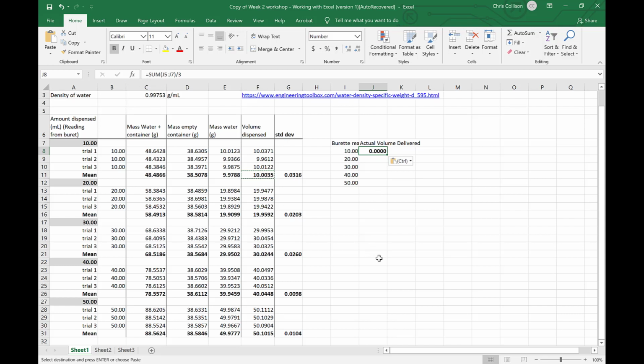So the next thing I want you to think about is how we might value paste something. I'm going to now press Control C. That copies cell F11, and I'm going to paste in here. Looking over on the left hand side, I'm going to paste for values in here, and when I click that value, that has accurately carried across the mean value from our 3 trials. I'm going to go ahead and use the same approach to fill the rest of these cells.